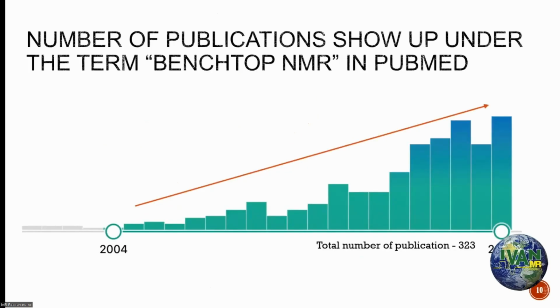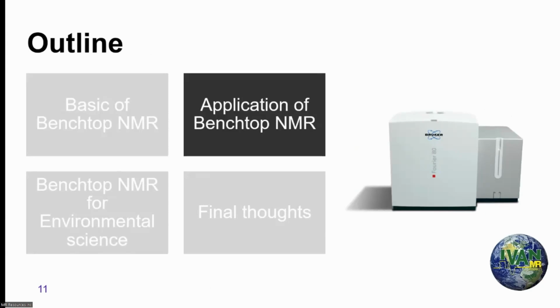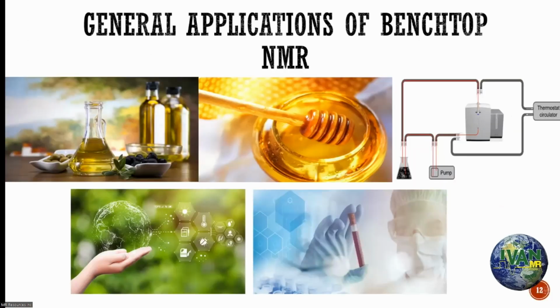I did a brief search on the keyword Benchtop NMR in PubMed. As you can see, the number of publications is going up, meaning that more and more people are using this Benchtop NMR system for a variety of applications. And this leads us to the next topic, which is the application of Benchtop NMR.